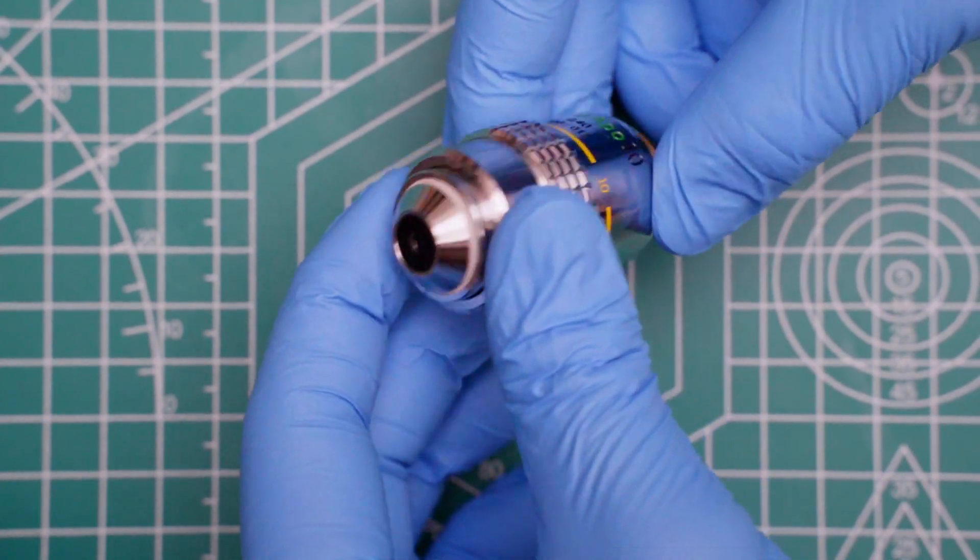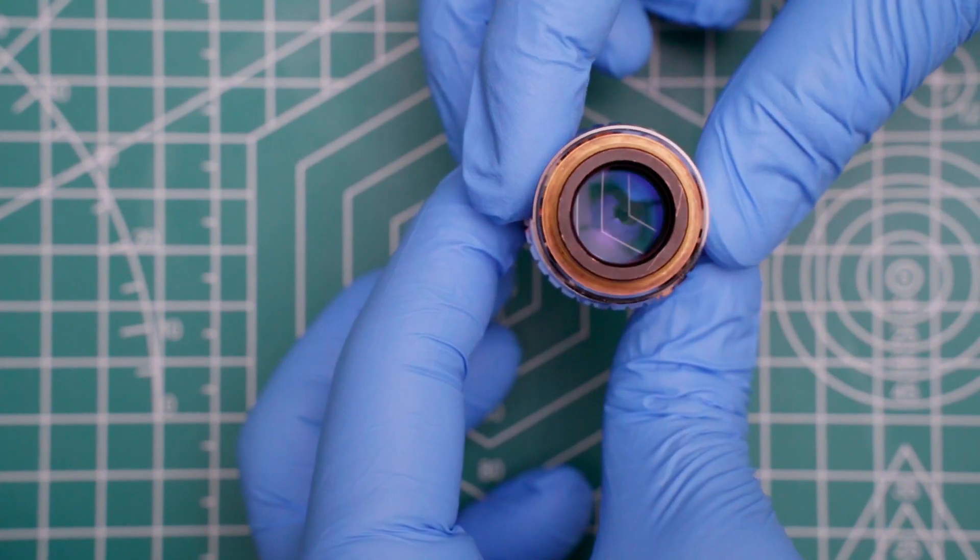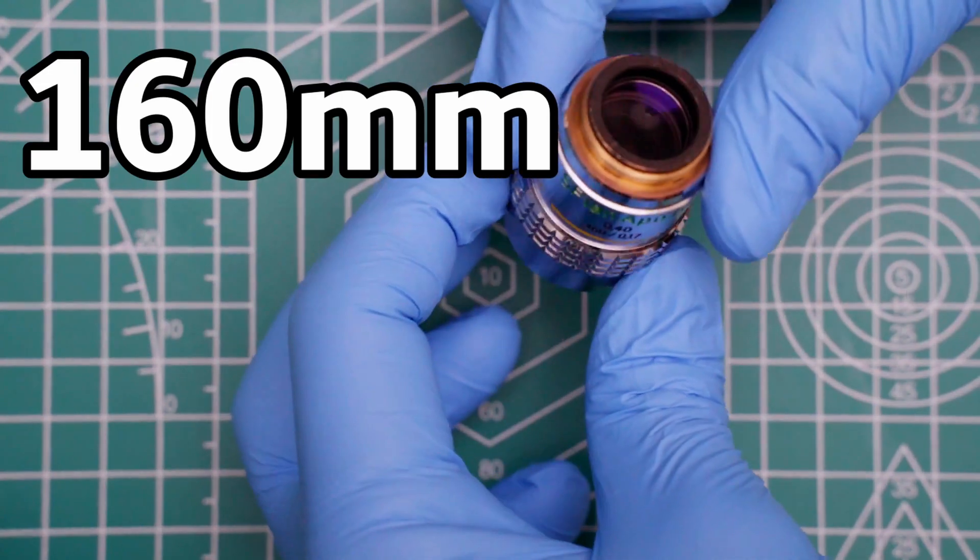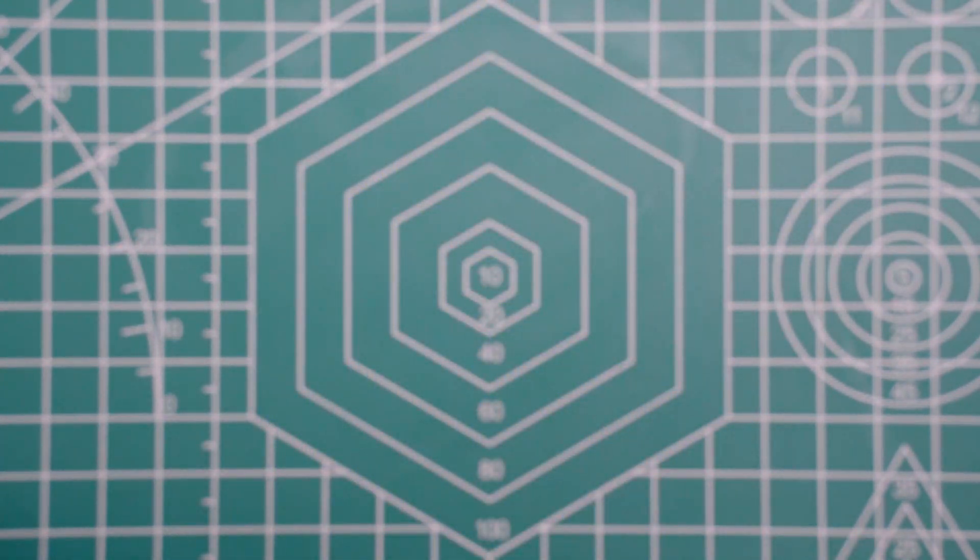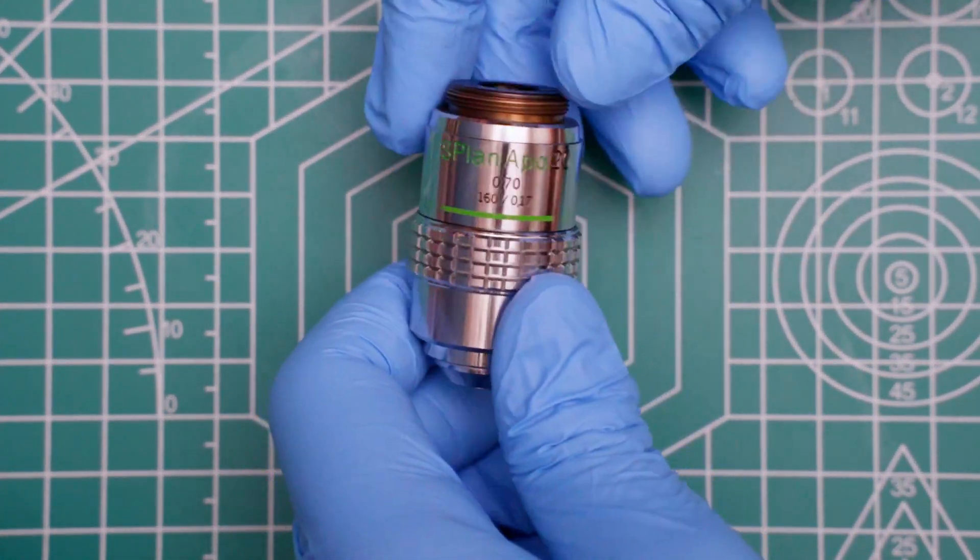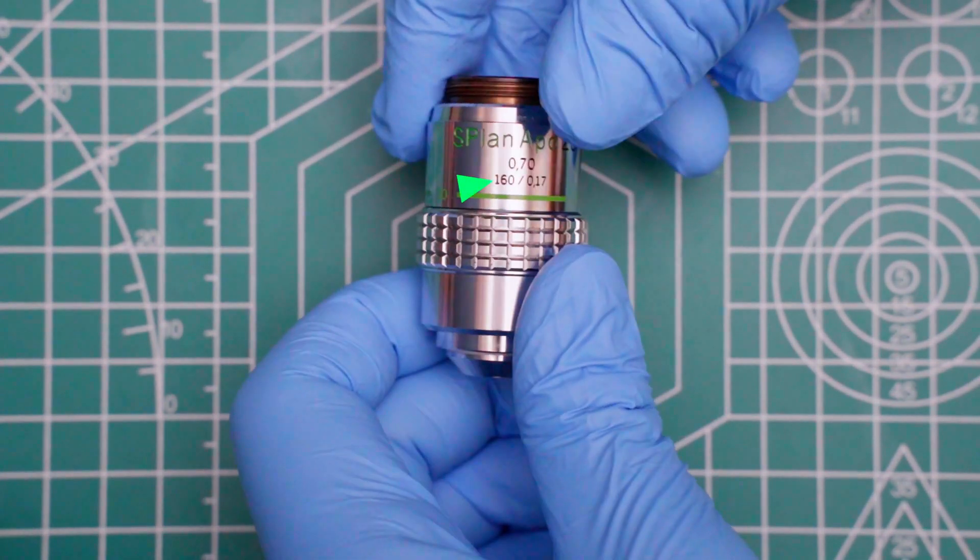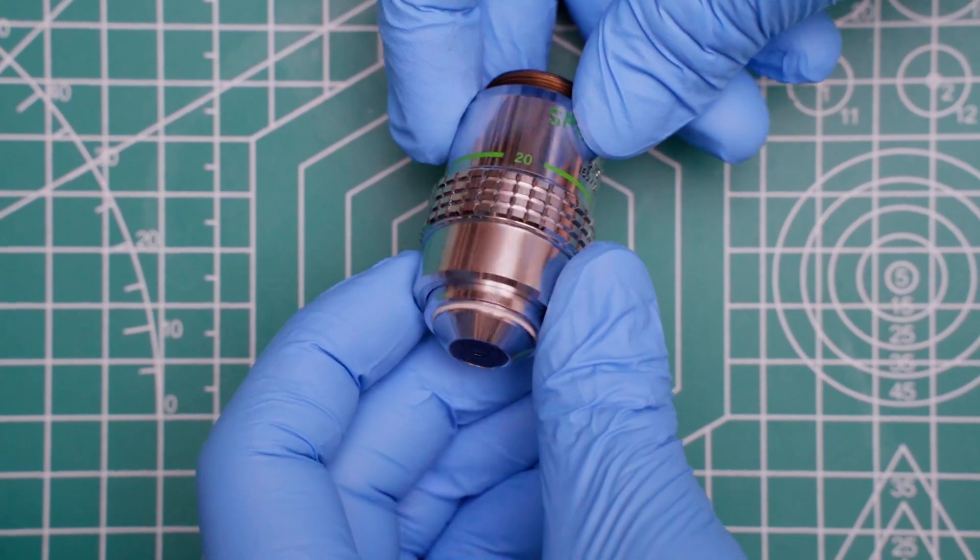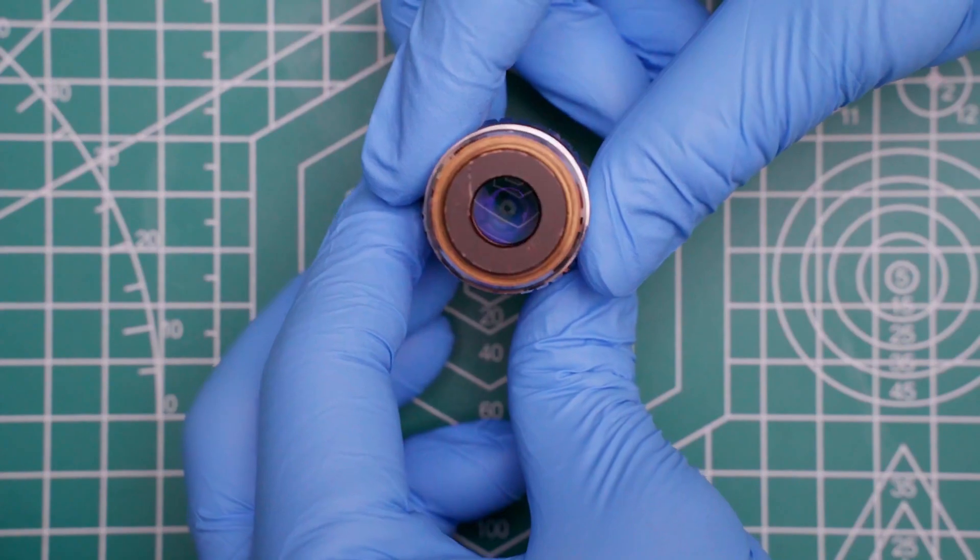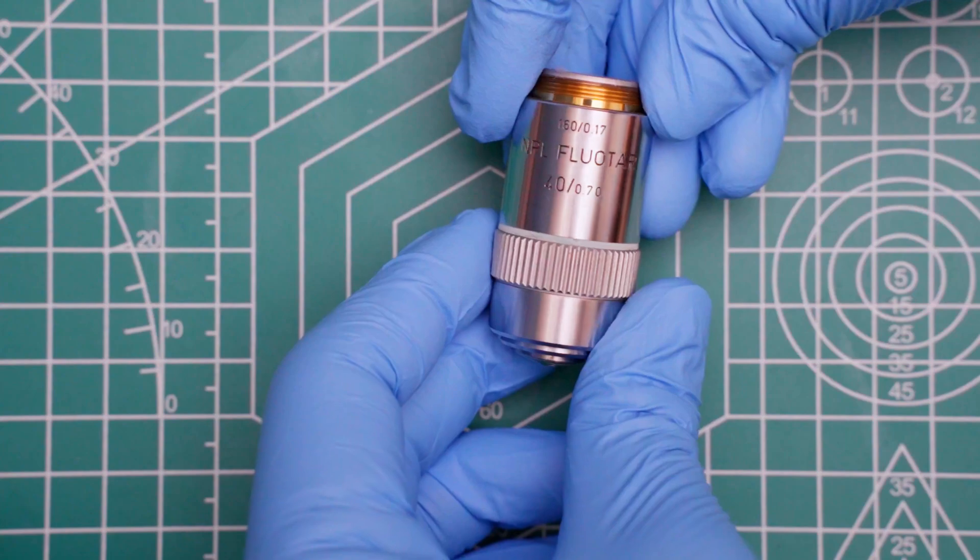Now before we begin, I want to start off by saying there are some assumptions I'm making about your microscope and what you want to do. The main one is that you're using a 160mm tube length microscope and not an infinity-corrected microscope. So if you're not sure, take a look at the objectives on your microscope. If they say 160 somewhere on the side, then you have a 160mm microscope. And if you see an infinity symbol on the side, then you have an infinity-corrected microscope. If you have a mix of both, call a priest. And if you see 170, call a German priest.